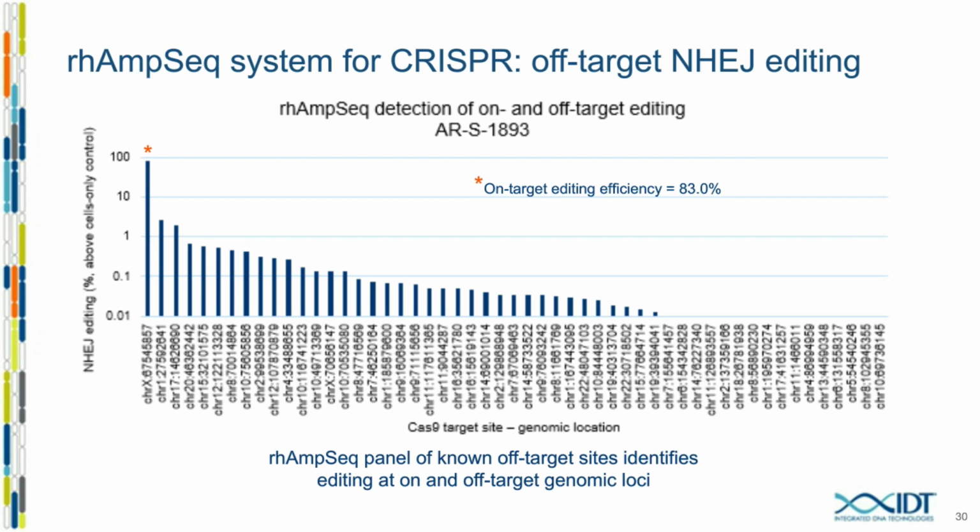And rhAmpSeq is quantitative, and people have asked how low of a frequency variant we can correctly call. It's true that people want to be sure they don't see off-target variants. So like in oncology, low-frequency variants become harder to resolve because of background noise of the assay, PCR and sequencing error. Researchers have claimed that they can resolve variants down to 0.2% with amplicon sequencing technologies. And we've seen for some target sites that's possible, but for others, it's not. For other sites, we see background noise as high as 7%. So we recommend setting our background noise level at 1%, and we're currently looking at ways to reduce this. So it may be possible that there are events happening down here and that we're just missing them because we're not actually able to pick them up.